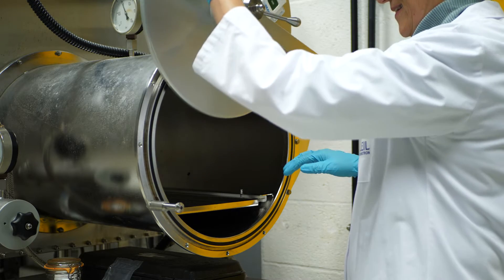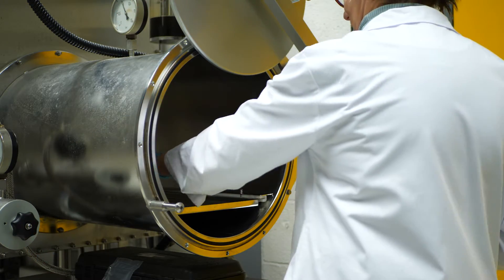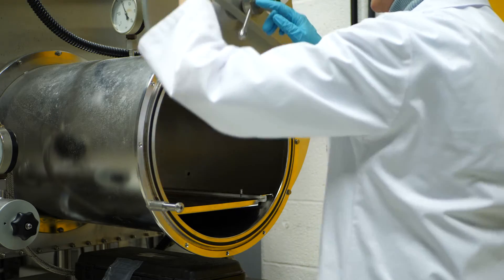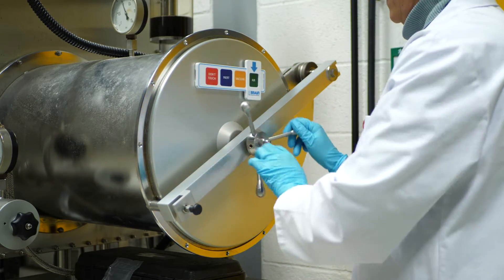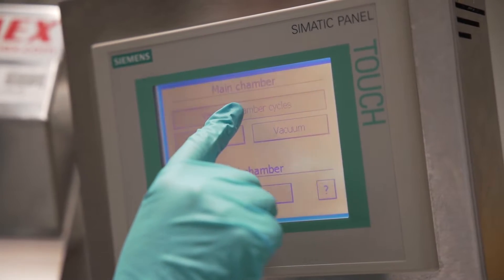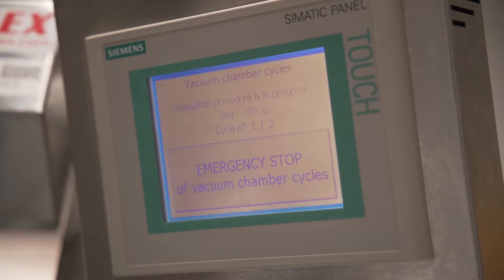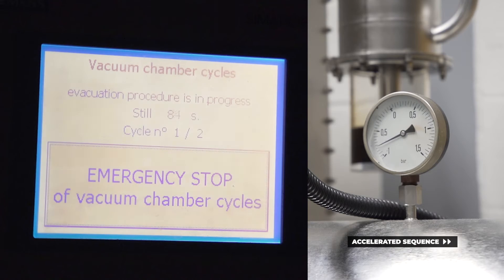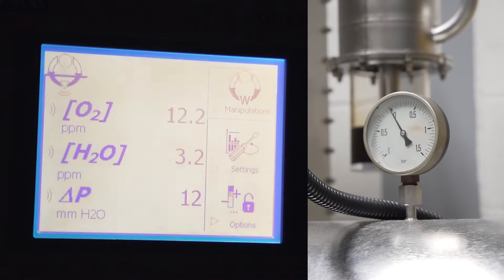You can now open the outer door of the main chamber and enter the necessary equipment. Close the outer door of the main chamber and turn the handle; at the end, close with a maximum of one quarter turn. Press vacuum chamber cycles and 2 vacuum and filling cycles will be performed automatically. This stage takes about 10 minutes. At the end of the chamber cycles, the panel screen returns to the home page.